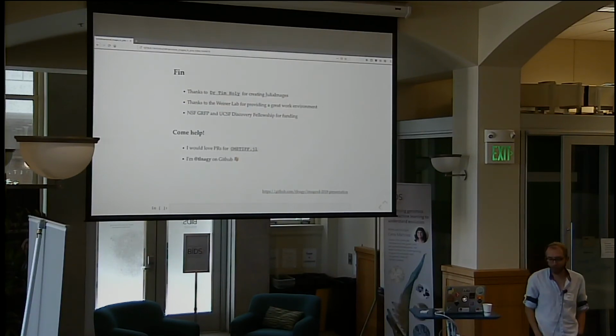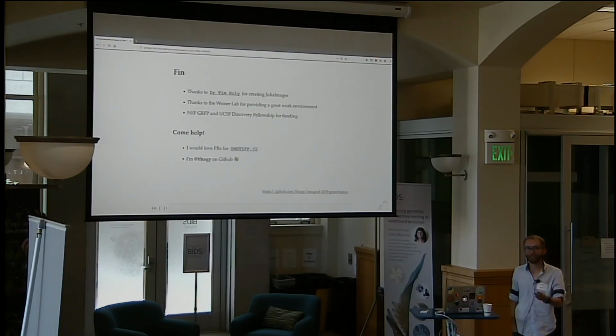Yeah, I actually use that every day. I haven't done it from the other direction, so I haven't called Julia from Python, but calling Python from Julia works extremely well. There's a package called PyCall, and I use quite a few Python packages, especially the data frame ecosystem, which seems to work really well translating between the two. Generally for images, I haven't seen that too commonly used.